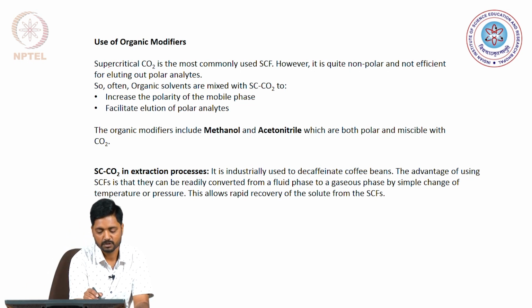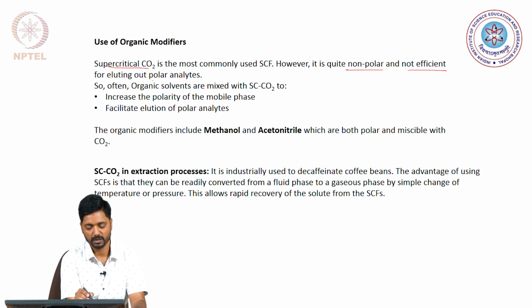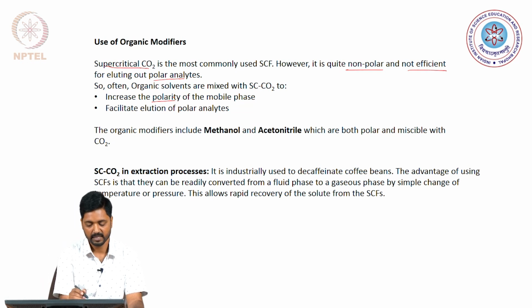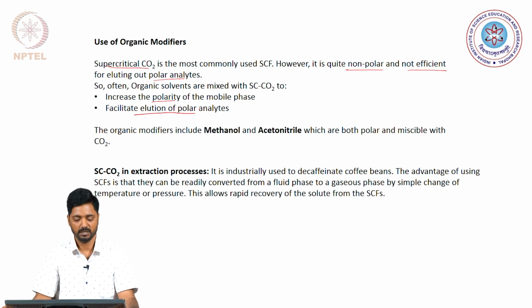When we use supercritical carbon dioxide, it has inherently low polarity, it is almost non-polar, and hence is not efficient for eluting out polar analytes. So, we add organic solvents to make the supercritical carbon dioxide a little bit more polar, that is increase its polarity, and that will facilitate better elution or faster elution of polar analytes.